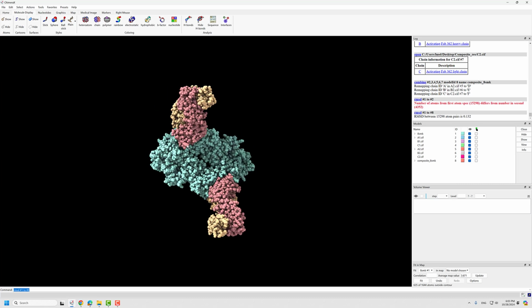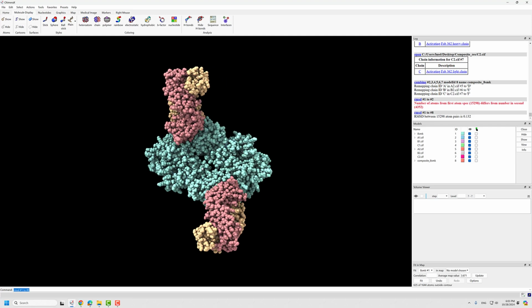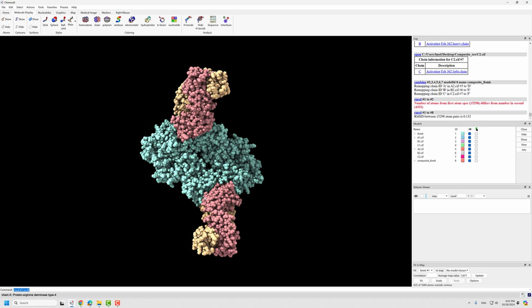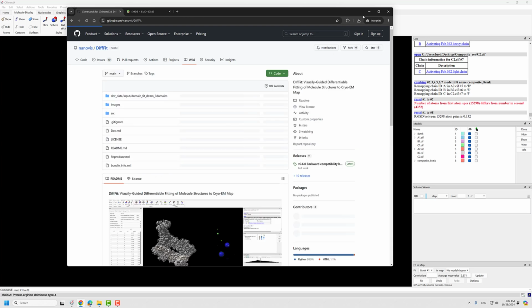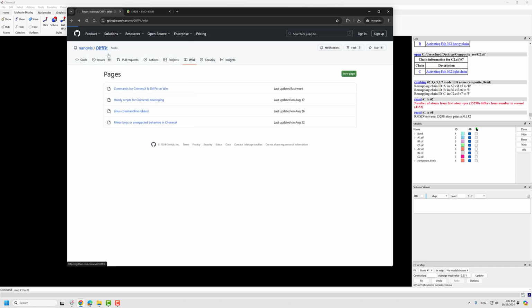So that's it for compositing a structure. Sorry for a few mistakes that I've made, and some of it I made on purpose because this is a demo tutorial, and these are the easy mistakes we are going to make. So you can try to composite others or real examples. The combine command and other split commands, you might consult the ChimeraX documentation for more information. Thank you.